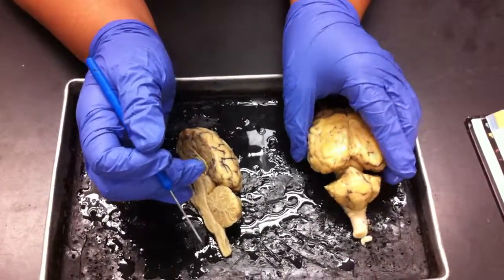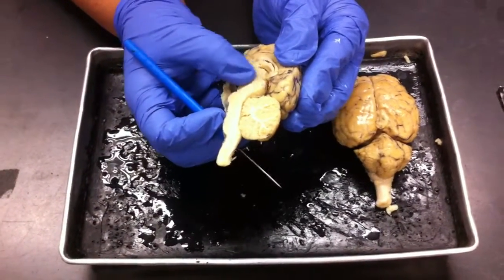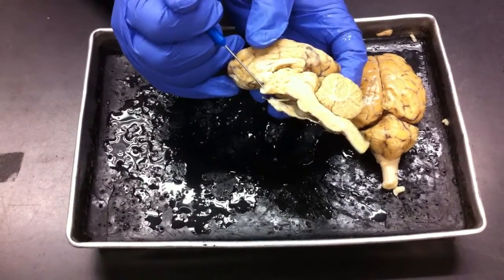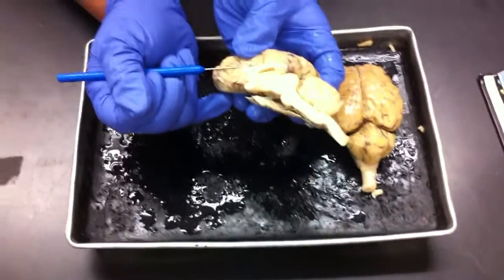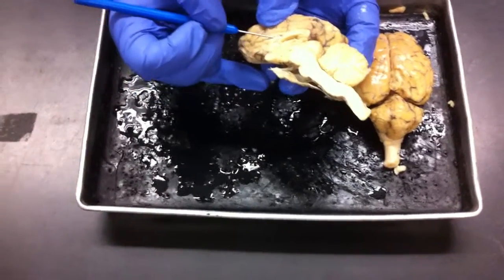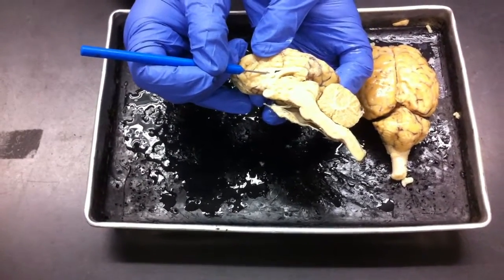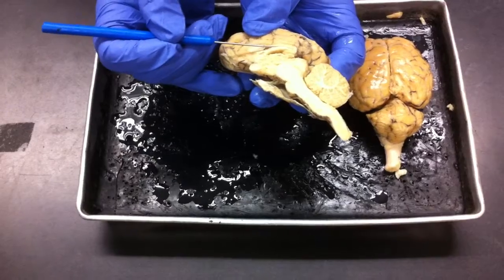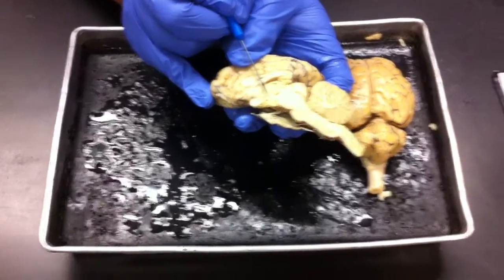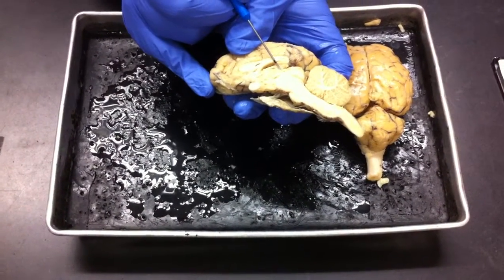On the lab practical, what's something they usually ask? They can ask for the optic chiasma because it is rather big. They can ask for bigger features such as the corpus callosum, septum pellucidum. If they put a pointer going through the septum pellucidum, that's referring to the lateral ventricle. They can ask for the fornix, the thalamus, and the hypothalamus is always going to be towards the front, so remember that towards the optic chiasma is the hypothalamus, and in the back is the epithalamus.